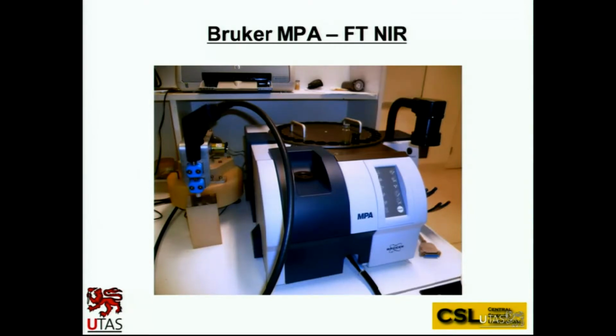We also have an optical fiber probe here, where we can simply point to anything that we want to measure. So you can bring samples up to the instrument and we can measure it through the fiber optical probe. We also have other gadgets. We've got a big auto sampler, for example, for wood cores that we used while Forestry CRC was still active here. So they're great toys.